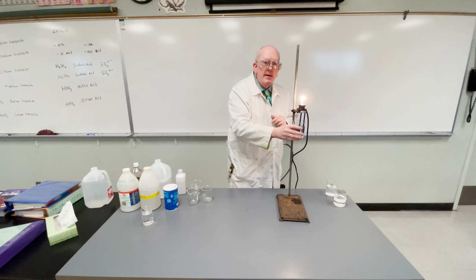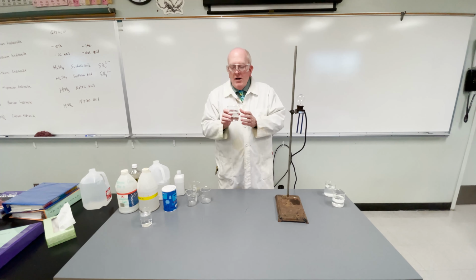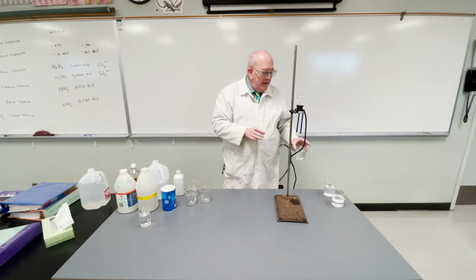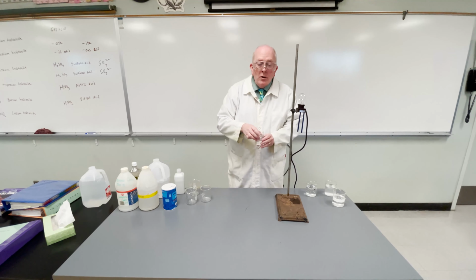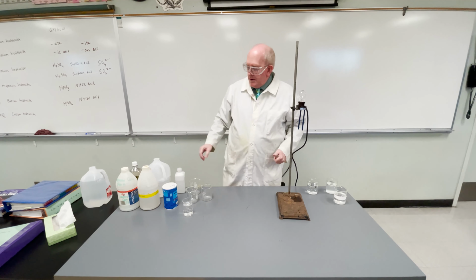And look at that. Nice and bright. Now you can't see it in the beaker, but there are just tons and tons of ions floating around in there. Some of them are hydrogen ions, some of them are chloride ions. And they are what is carrying the electric current between the two blue posts.